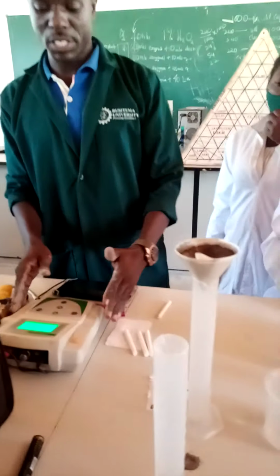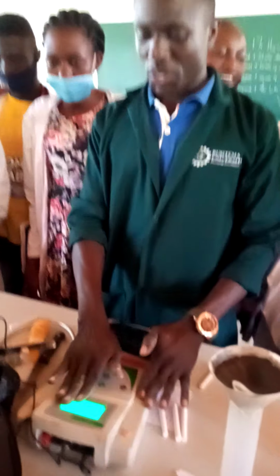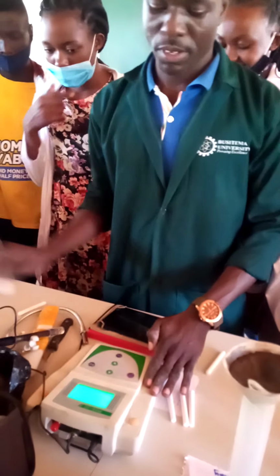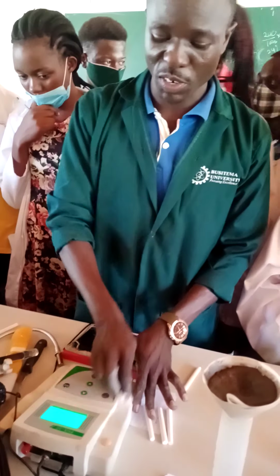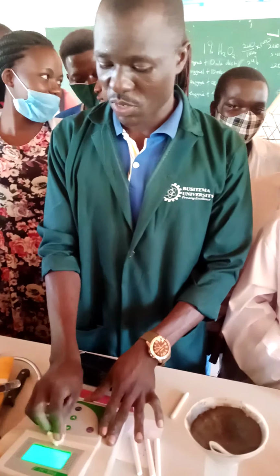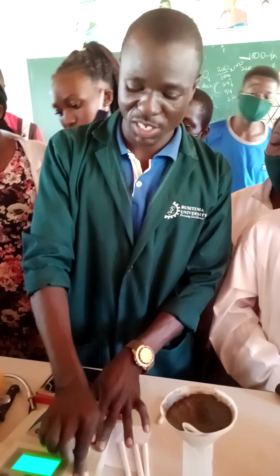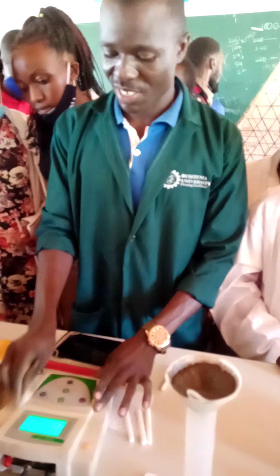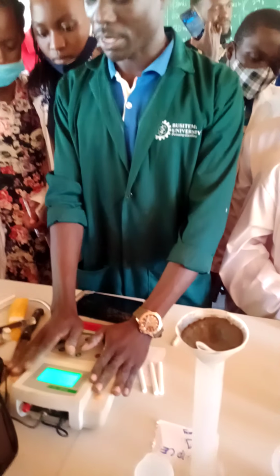So this is a standard pH meter. This is where you read off the values for soil. That's why I went for a green overcoat, not a white one. So you guys will want to use maximum. Put on this one. This is a pH meter.